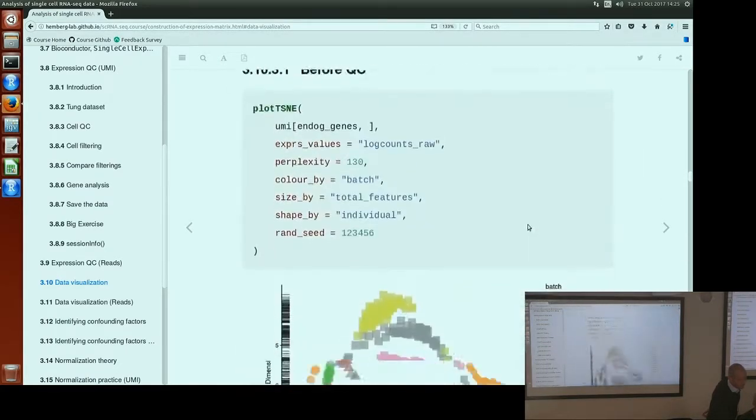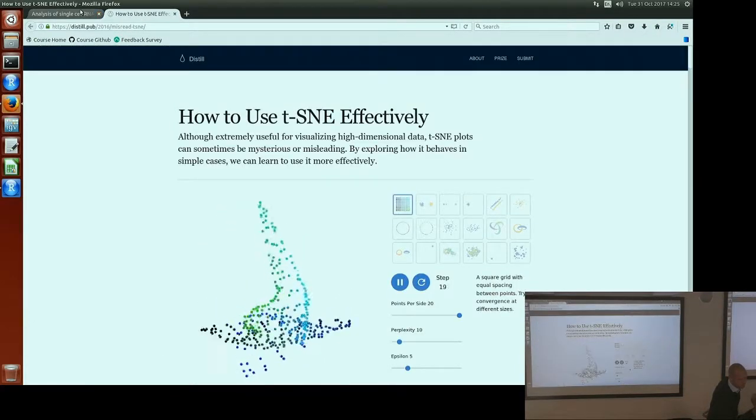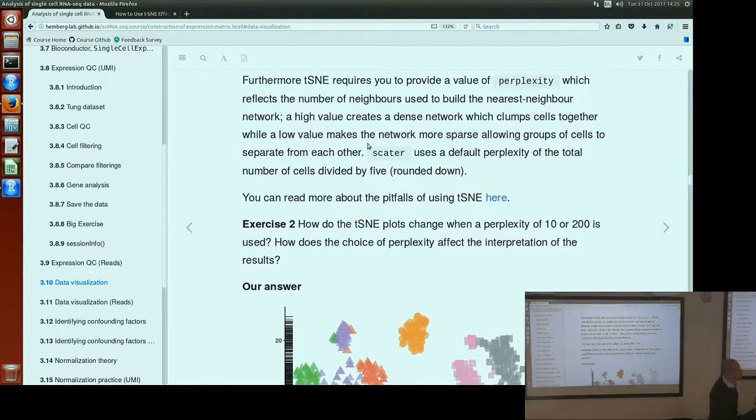One of the traps for interpreting t-SNE plots is that, unlike a PCA, where we've got 2 well-defined length dimensions, the first principal component and the second principal component, t-SNE does not have this property. So the length scales are different at different regions of this 2-dimensional map. It does that so it can try to capture what it understands as the high-dimensional structure of the data in 2 dimensions. The big problem for all of these approaches is that there's a lot more space in 10,000 or 15,000 dimensions than there is in the 2 dimensions that we want to look at. This is known as the crowding problem. How do you faithfully represent the distances between points in a very high-dimensional space when you only have 2-dimensional space to work with?